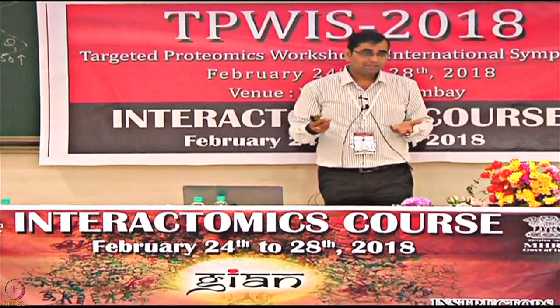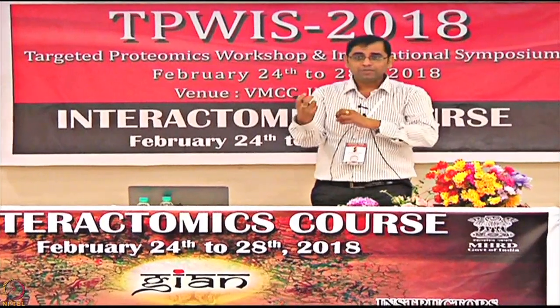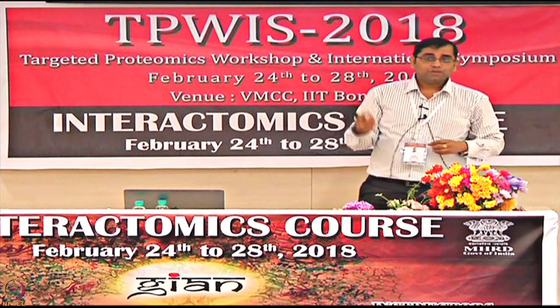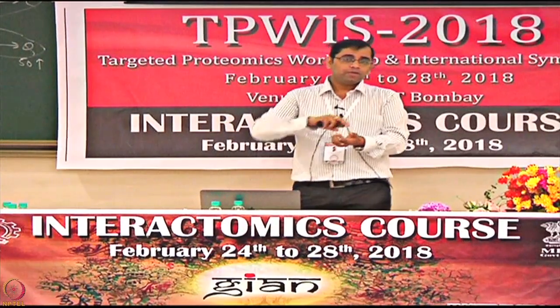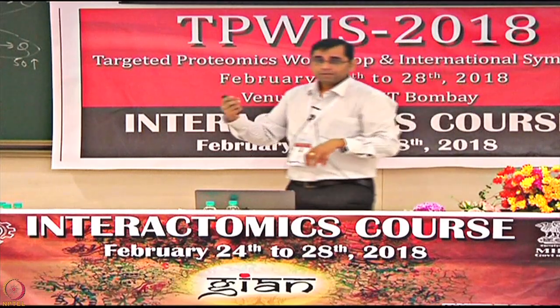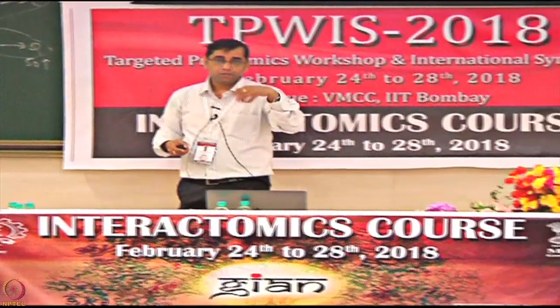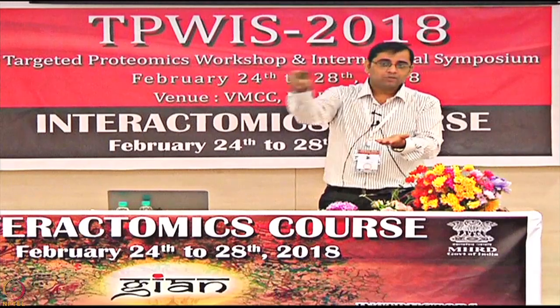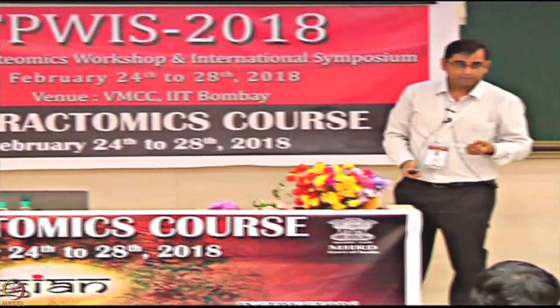What can be the actual power of the technology is that you have an unknown protein printed, and now you are passing a lot of compounds, and you can see whether they are binding or not, right? And then can I discover something new which is binding? But what is that new thing which is binding, which you have no control over, which you have no idea about? So, eventually you want to identify that particular binding with the mass spec. But in a real situation, if you have done mass spec, you would realize you need enough of the peptides which is required for detection of those peptides. And in the SPR experiment you are doing, things are at very low concentration. That's not sufficient to give you enough peptide for doing the experiments.